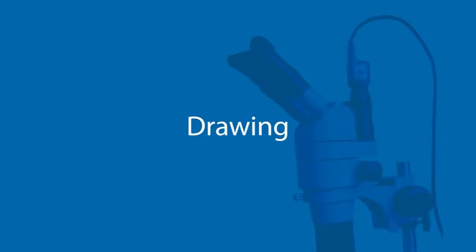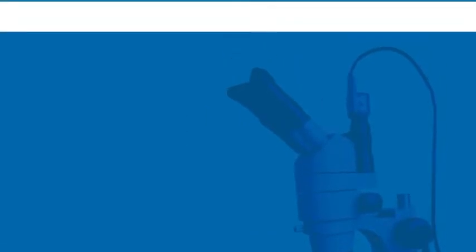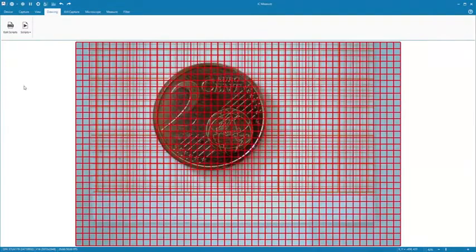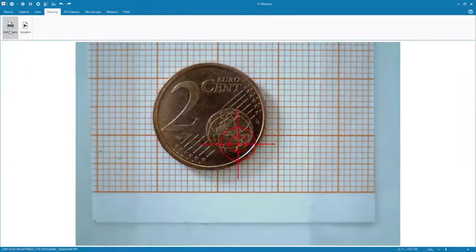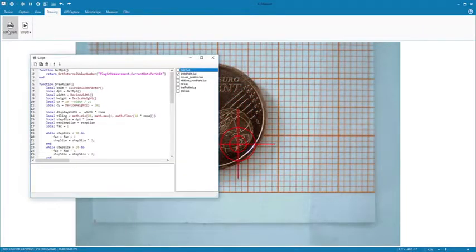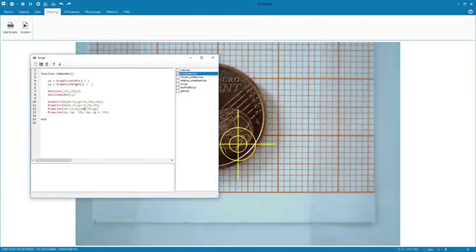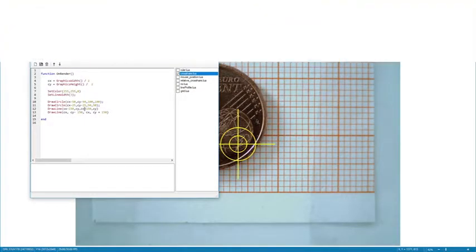Under Drawing, built-in scripts make LiveView display of crosshairs, rulers, grids and more possible. In addition, these overlays can be quickly customized for special tasks. Simply click on Edit Scripts.